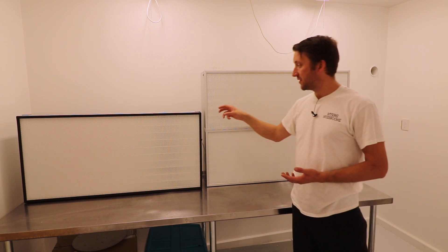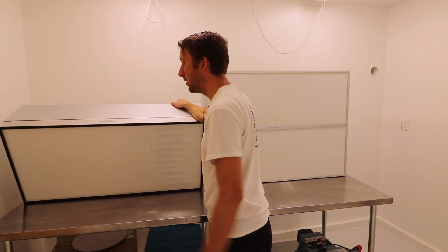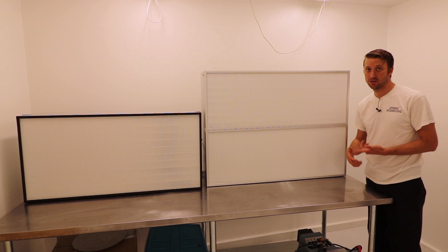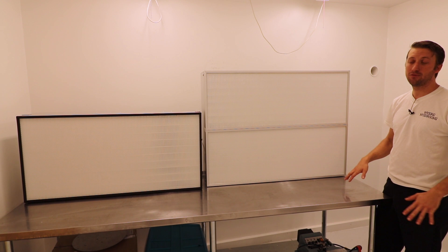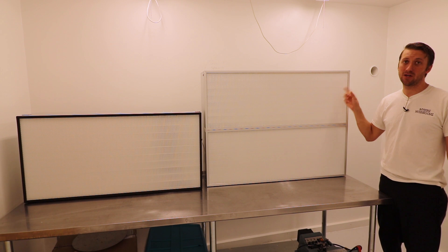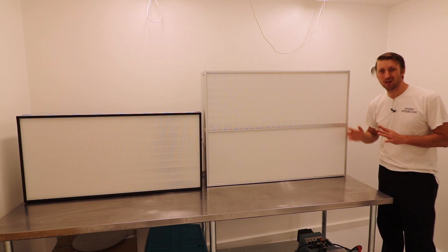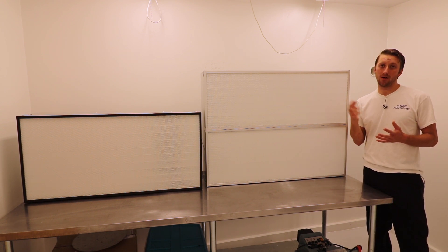One thing people ask is: is a 3-inch filter thick enough for laminar flow? These are what they use in labs — designed for flow hood cabinets and enclosures, or rooms with whole-room downflow or crossflow. 100 feet per minute is all you need; you don't need more than 3-inch thickness. They flow about 150 feet per minute with no pre-filter when new, and you'll see about a 10–20% decline over the years as the filter clogs up.